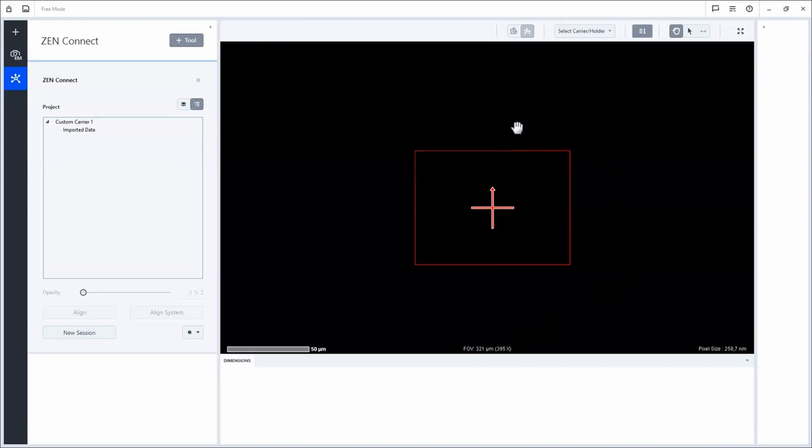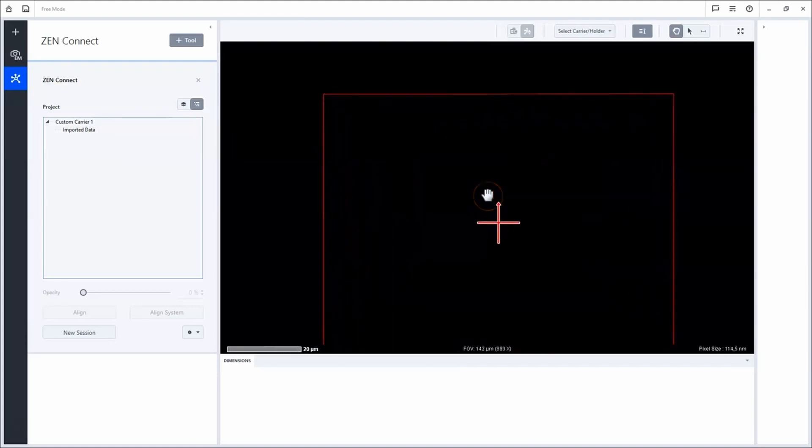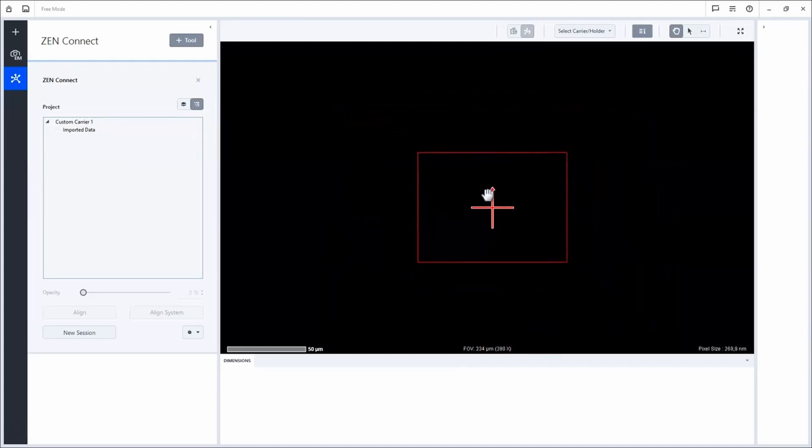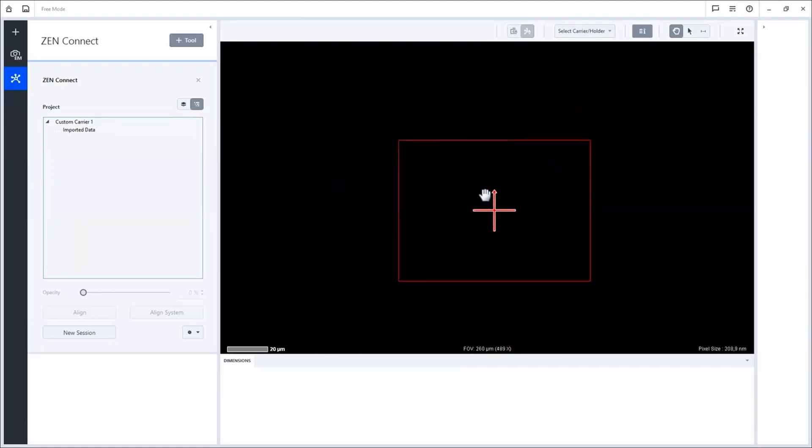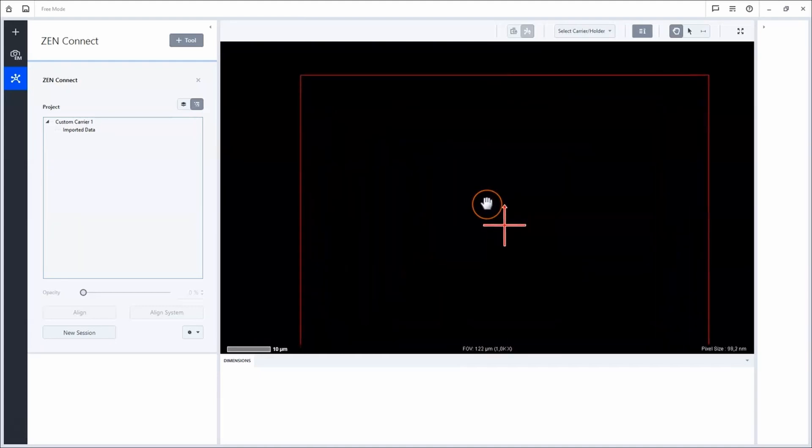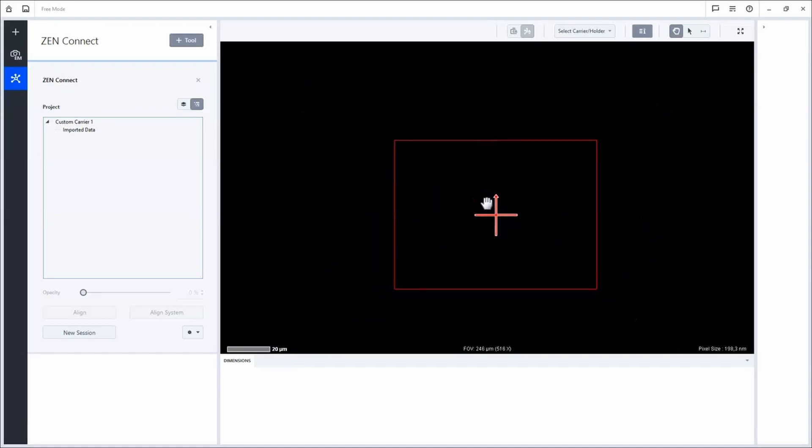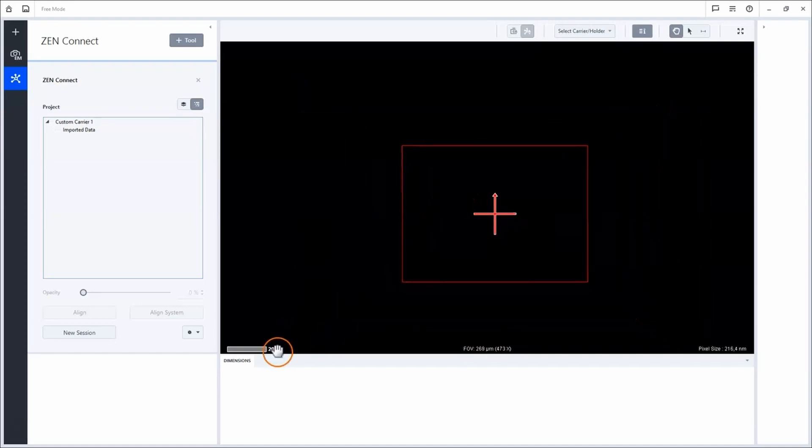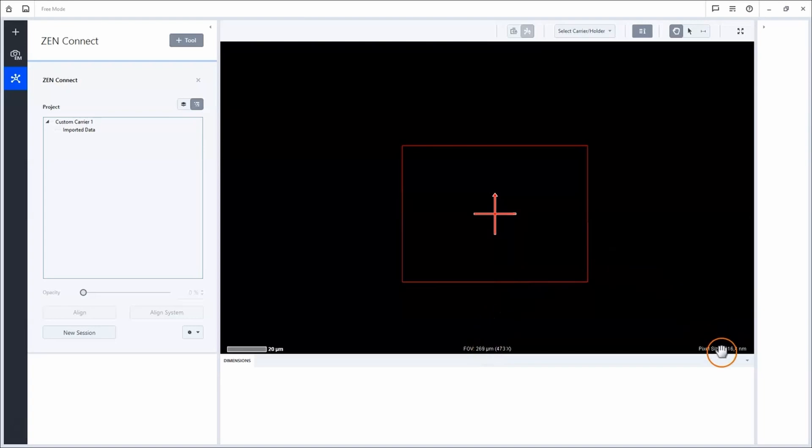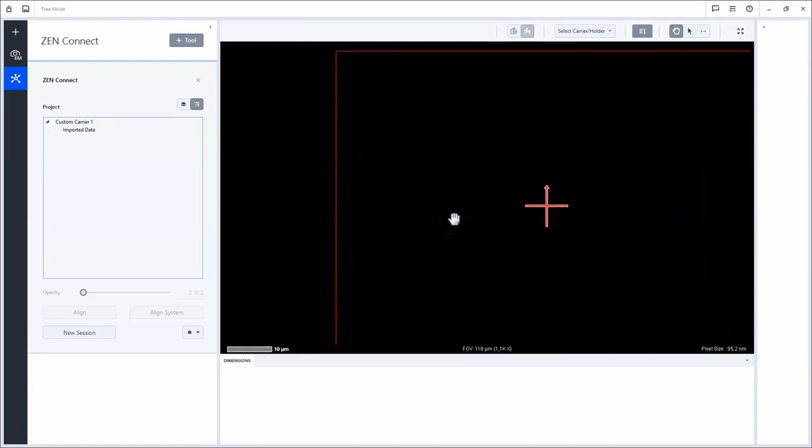You can imagine it as your desk where all your image data are visualized in context. By scrolling with the mouse wheel, you can zoom in and out and the scale bar, field of view information and image pixel size adapts accordingly.